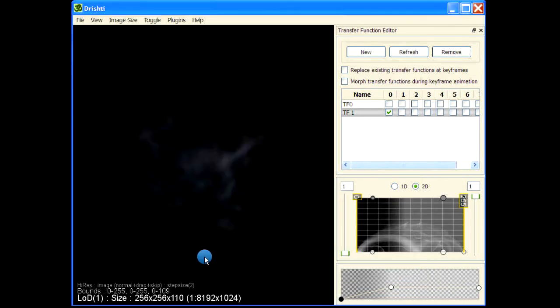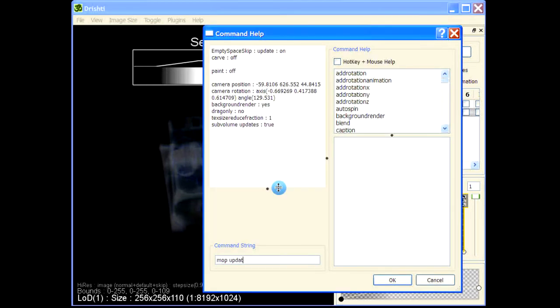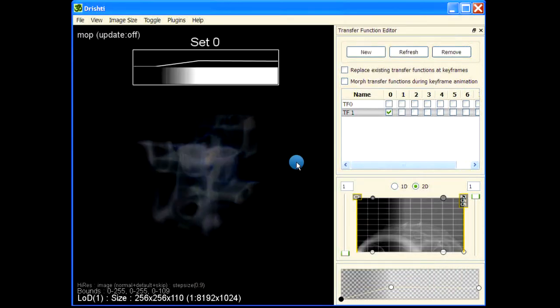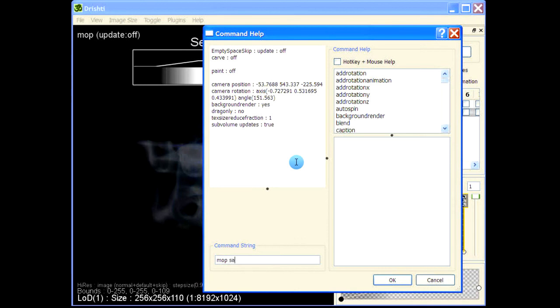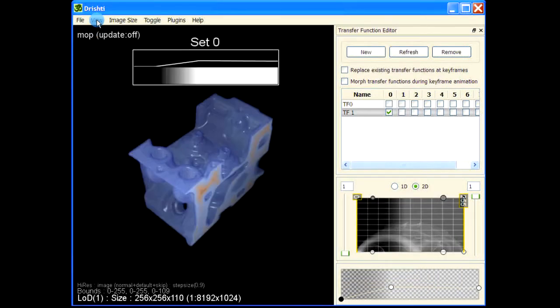So we have done that, and you can start seeing this coloring. Let me also turn off the updates to the mask buffer. So I'll turn off the update. I have turned off the update to the mask buffer, and I would also like to saturate channel 0. So anything above 0 in the mask buffer will be set to 1. So then we get the full opacity.